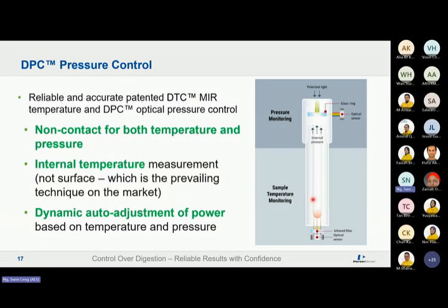But with a probe, because the probe is not immersed in 5 ml of acid, they force you to use 10 ml of nitric acid. You see, the acid content becomes double. So that's why I want to highlight again: if you use a probe, you have to consider that you might need to change the probe, and your acid consumption will be almost double.